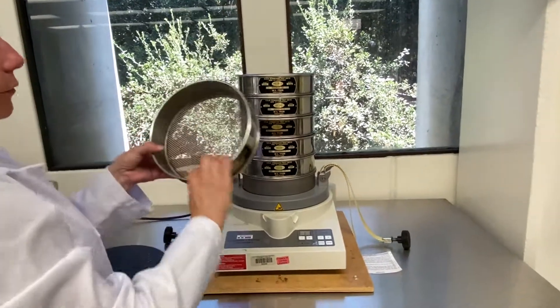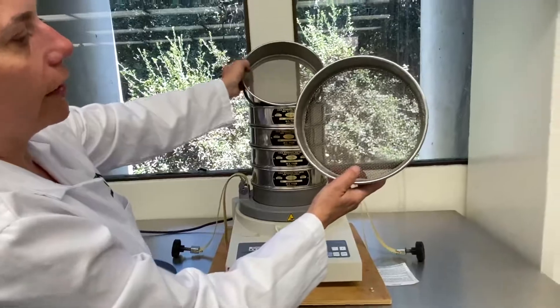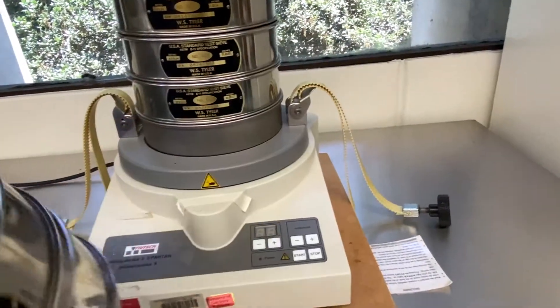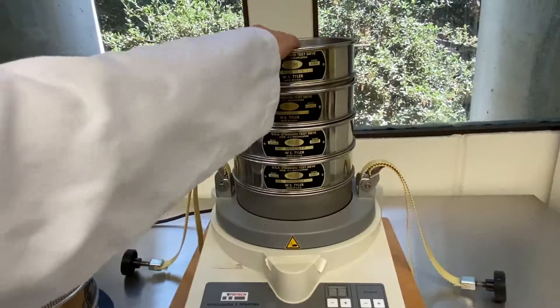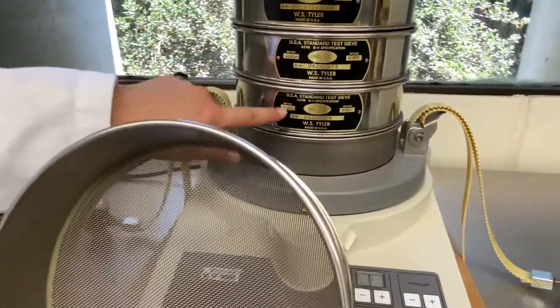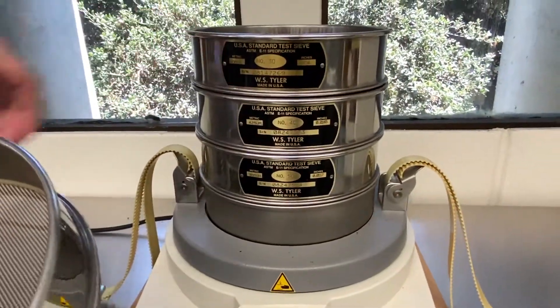What a sieve shaker is, is we have different size sieves. You can see the coarse, larger openings are towards the top, and as we go down the openings become smaller and smaller. As you can see, the openings become smaller and smaller as you go down for each sieve, so the size of each sieve opening will be smaller as you go down.